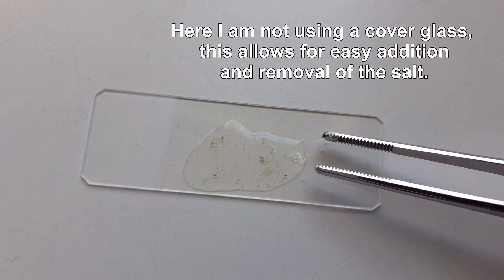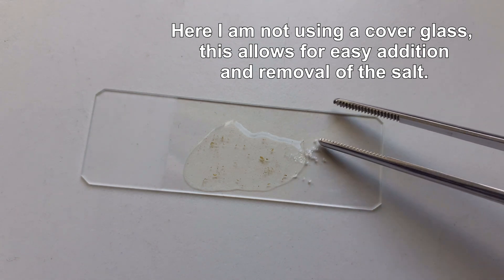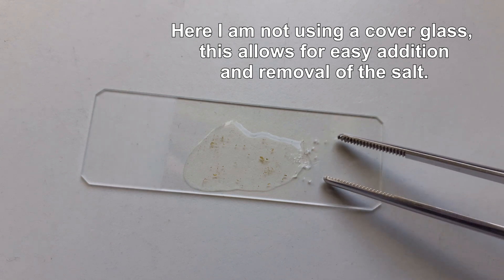All you have to do is add a little bit of salt to the edge of the cover glass. What's going to happen is that the salt will dissolve and diffuse into the specimen water, and because these are freshwater organisms they like to avoid the salt. They're going to move to the other side of the cover glass, and after a few minutes you will have most of them concentrated on one side.